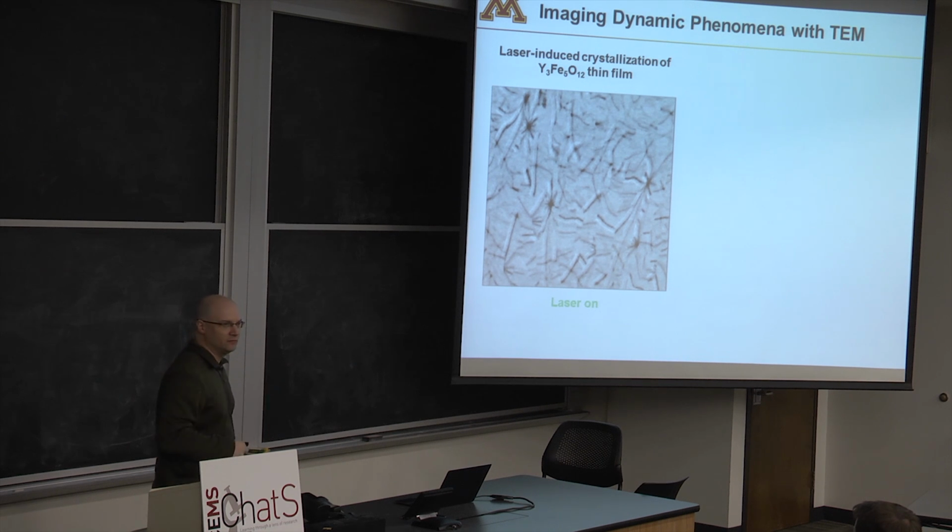We can learn a lot from that, right? We can use Avrami kinetics and things like that to understand this. Hopefully you guys remember that, right? Avrami, yeah? Okay. And so that's pretty interesting, but let's think about the time scale associated with this. And then let's think about, you're all curious, I'm curious. Let's ask some questions about what was happening. For example, this thing is crystallizing in a certain way, so how are the atoms actually rearranging themselves to go from disordered to ordered? How does that happen, right? And why does it happen in the way that it does? These are the questions we can start to think about. What will we need to do to answer those questions?